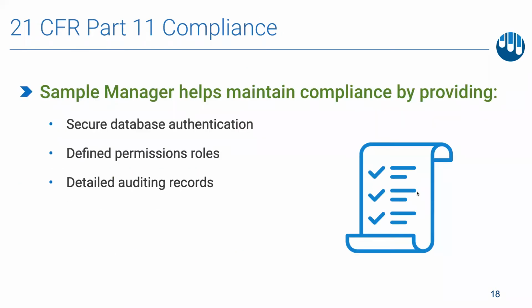LabKey Sample Manager has been built for labs operating in 21 CFR Part 11 compliant environments. With password-protected login, defined permissions roles, and detailed auditing of records, it is easy to track what was performed when by which team member. By using Sample Manager in conjunction with good laboratory practices, it will be easy to track and maintain good records in the case of an audit.